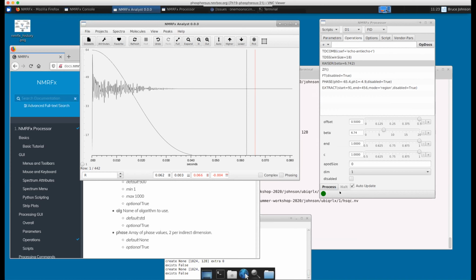Oh yeah, right. And it will pop up a window to get the stack trace. It turns out in the nmrbox environment, it's very hard to resize that window to see the full thing. But you can see enough of it that you can press Control A and Control C to copy it. So if you send me that, then I can see exactly where in the code it's failing.